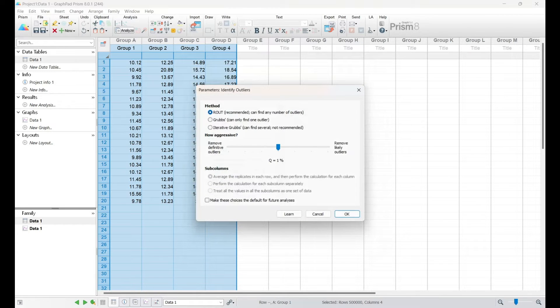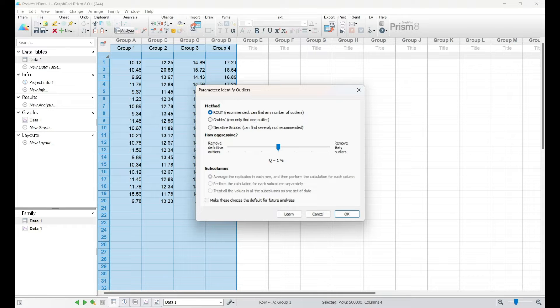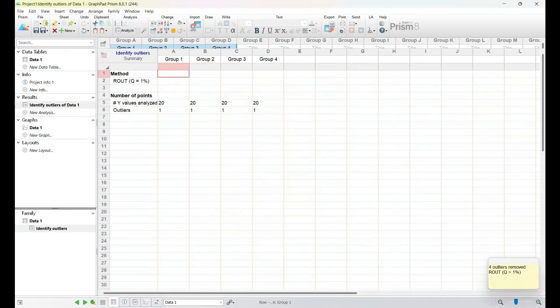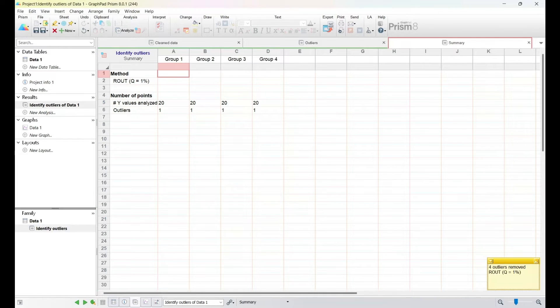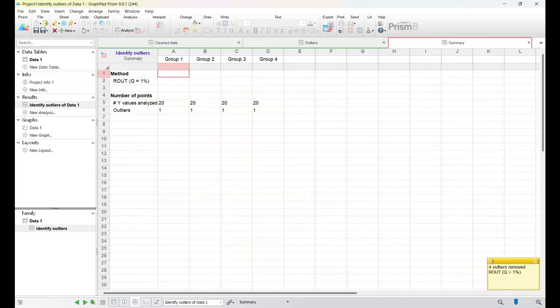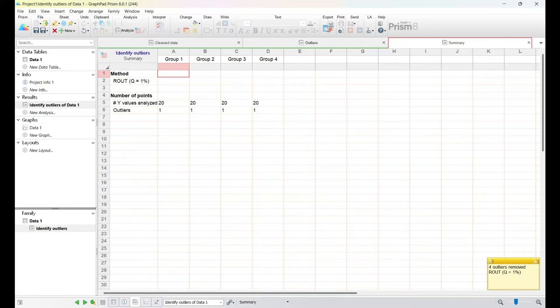This opens up a range of outlier detection methods, such as Grubbs test or the ROUT method. I'll guide you through the process of choosing the most appropriate method for your data and interpreting the results.